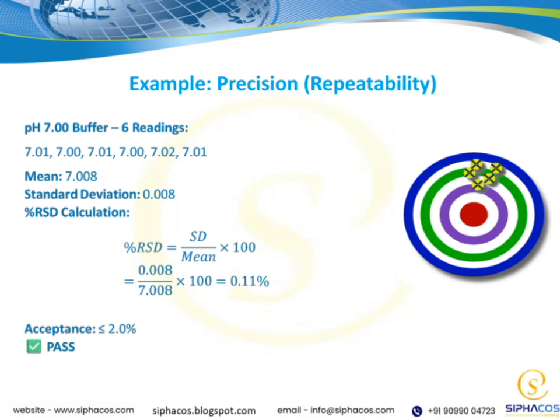This consistency is crucial for quality control and ensuring that our products or processes meet the same standards every time. By emphasizing repeatability, we're reinforcing the overall theme of precision, highlighting that accuracy isn't just about hitting the target once, but about consistently achieving the same results. This reliability builds confidence in our processes and helps us identify areas where we can improve stability and performance.